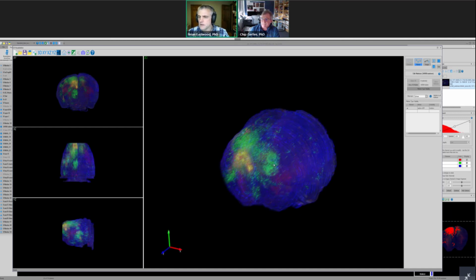Yeah, and one thing that you might be noticing is that we have an imaging system that loads information at different resolutions depending on your processor power and the size of your screen, and it selects the appropriate resolution to load, and then it updates that with higher resolution data as more processor power becomes available as you're waiting. So you'll actually see the resolution, the detail change as you're looking at these visualizations.